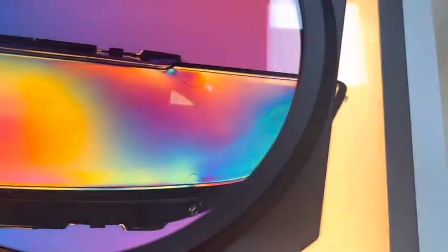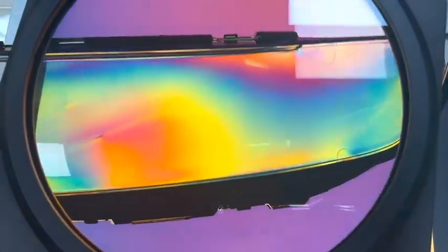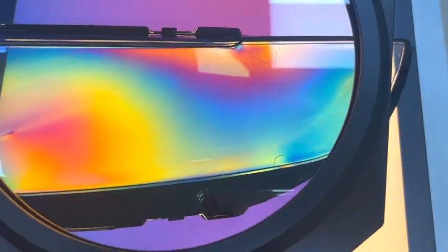If a sample is stress-free, we can only see clear areas without colorful stress patterns.